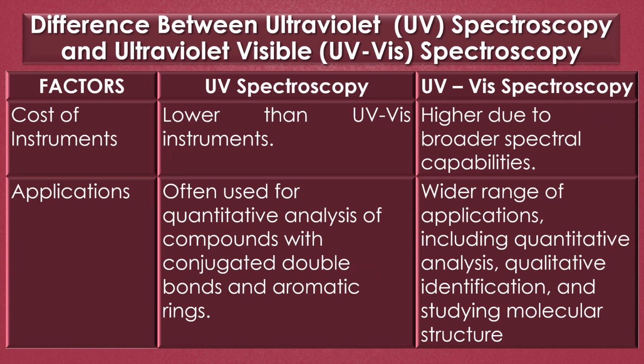Cost of instruments. UV spectroscopy instruments cost less than UV visible instruments. In contrast, the cost of UV visible spectroscopy is higher due to broader spectral capabilities.